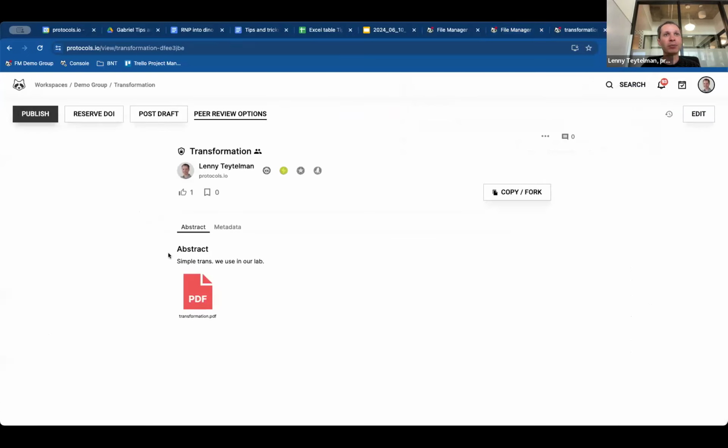Not what we recommend, but with a PDF document you cannot just create a public link, whereas if you have attachments and you put in the abstract, you could get a DOI, and you could include it instead of supplementary material in your research publication. So it does become easy to share it without inviting people into your workspace, or maybe your collaborators outside of your research team. Those are the advantages of doing it as an attachment.